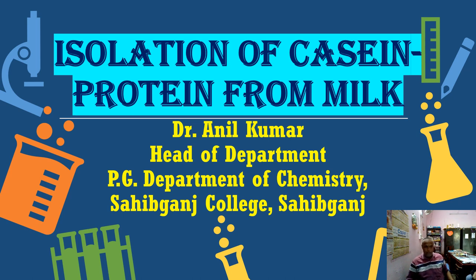Today, we'll discuss a very beautiful practical of PG Semester 4, and the practical title is Isolation of Casein Protein from Milk. Here, we have taken two types of milk. Number one is Mega, which is a Jharkhand product, and another milk we have taken from Sudha, which is a Bihar dairy product. We have used these two milks, and we separate or isolate the different caseins found in the Mega milk and Sudha milk.